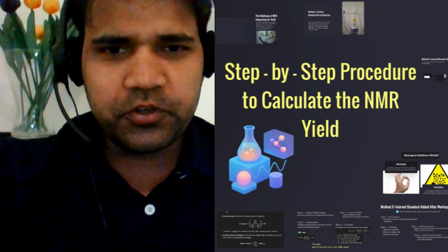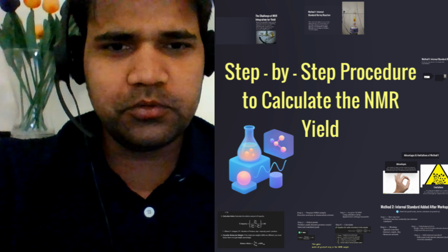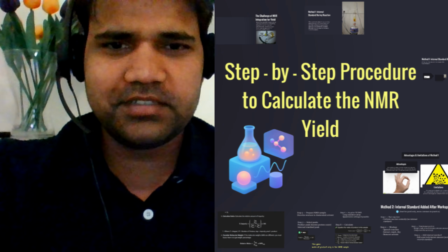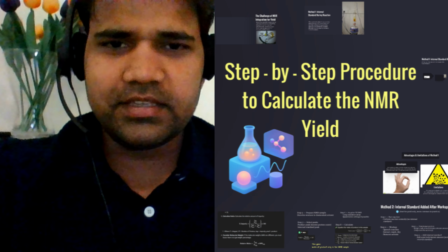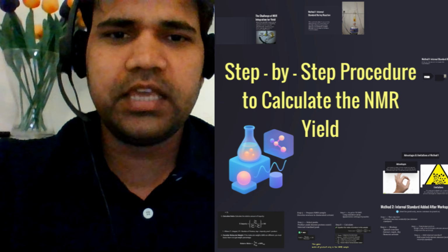NMR is one of the most powerful tools for determining the structure of organic compounds. But what if I told you it can also be used to determine the yield of your reaction without purification? Yes, there are two practical methods by which you can determine the yield of your reaction using the NMR technique.